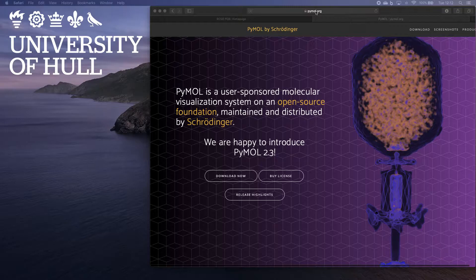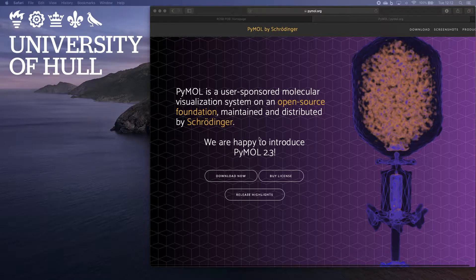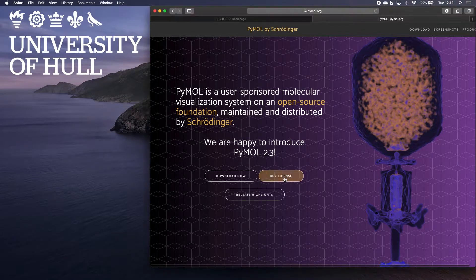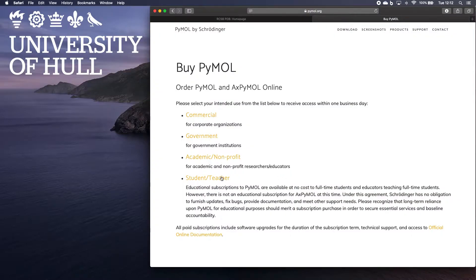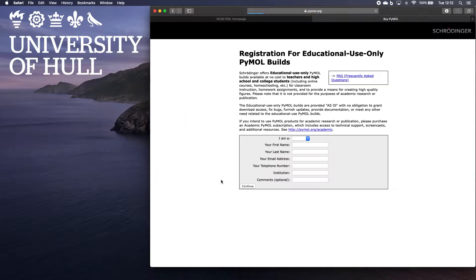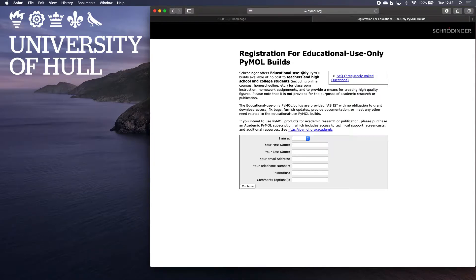And you can find it here, just Google Pymol, there we go, and then click on here, buy a license, and click on the student teacher one, and that allows you to get an education use license yourself.